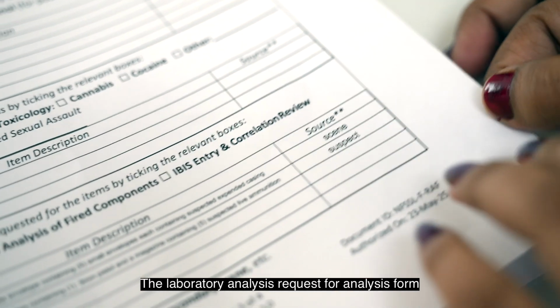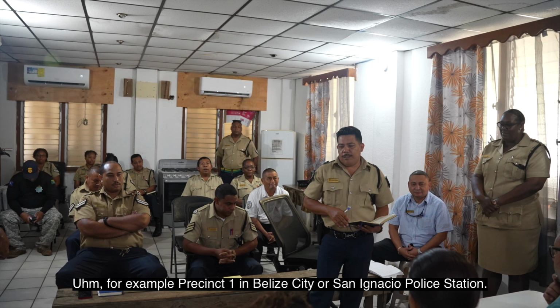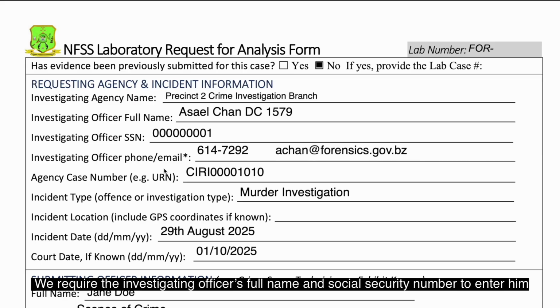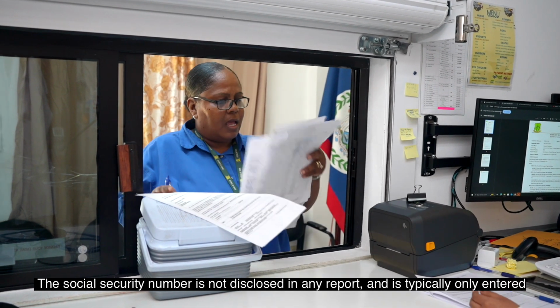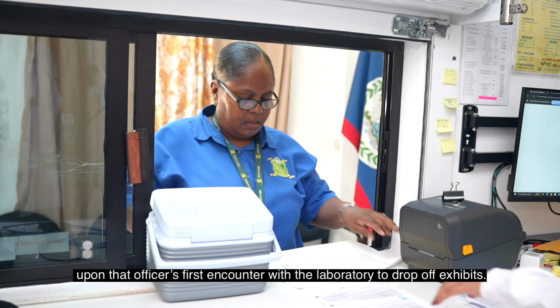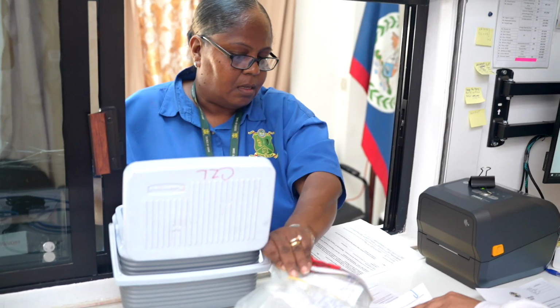The laboratory request for analysis form begins with stating who the investigating agency is. For example, Precinct 1 in Belize City or San Ignacio Police Station. We also require the investigating officer's full name and social security number to enter him or her as a user in the Laboratory Information Management System, or LIMS. The social security number is not disclosed in any report and is typically only entered upon the officer's first encounter with the laboratory to drop off exhibits.